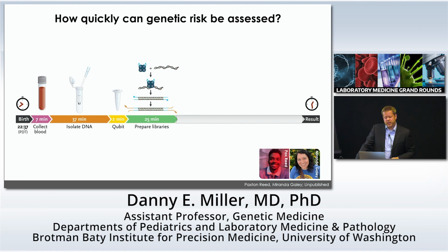We then prepared the DNA libraries for sequencing. We use a special kind of library kit called the Rapid Kit from Nanopore. This is a transposase-based kit, so basically you add the transposase to the DNA, it randomly integrates, and that creates a new site for those library adapters to attach to. In reality, it takes about 10 to 15 minutes to do. Because we were making a lot of libraries, it took us about 25 total minutes to make these libraries for sequencing. We then loaded the flow cells for sequencing.